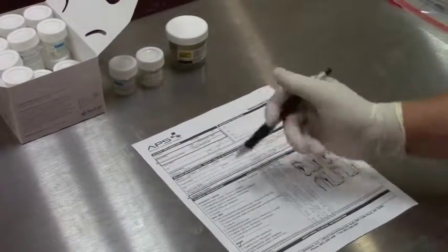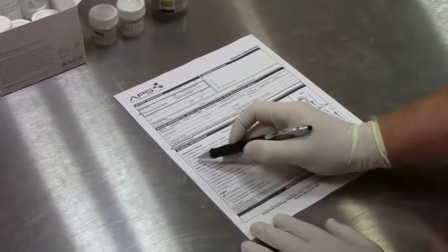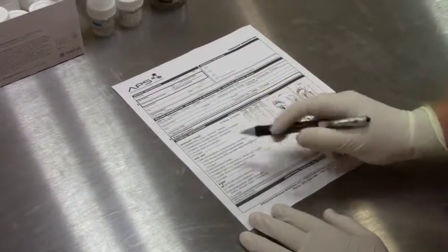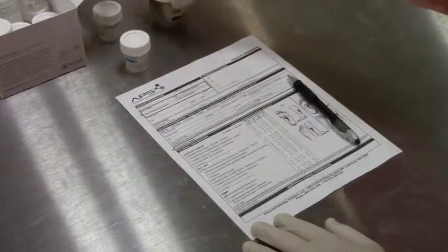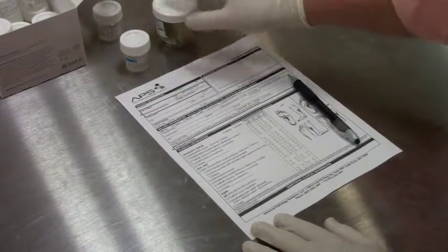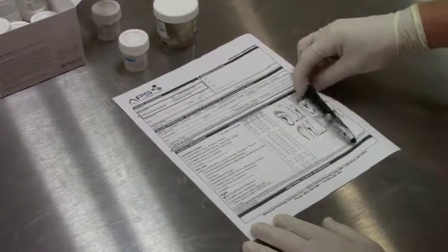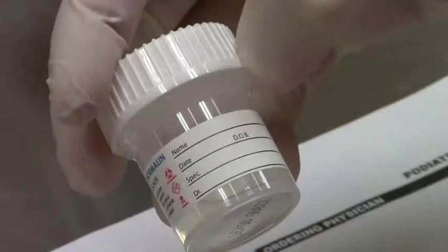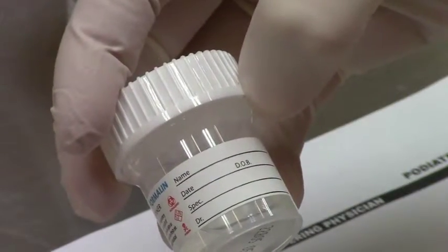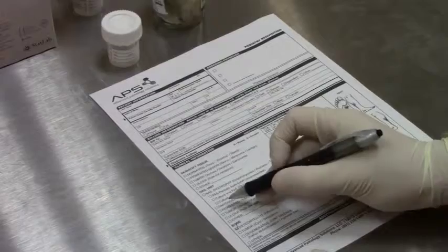Okay, on the APS requisition form, on the clinical information, we want to make sure that you check which type of tissue you're sending in the bottle, and also make a note you'll be provided some 20 ml bottles and also some 40 ml bottles, 40s or 60s, depending on what kind of surgeries you're going to perform. And you want to make sure that you label the patient's name, the date, the specimen type, the doctor, and the date of birth. The specimen type will also be listed here on the requisition form and checked what part it is.